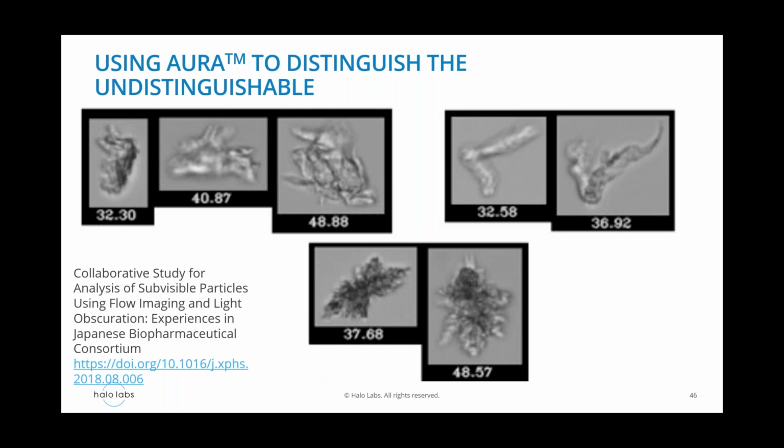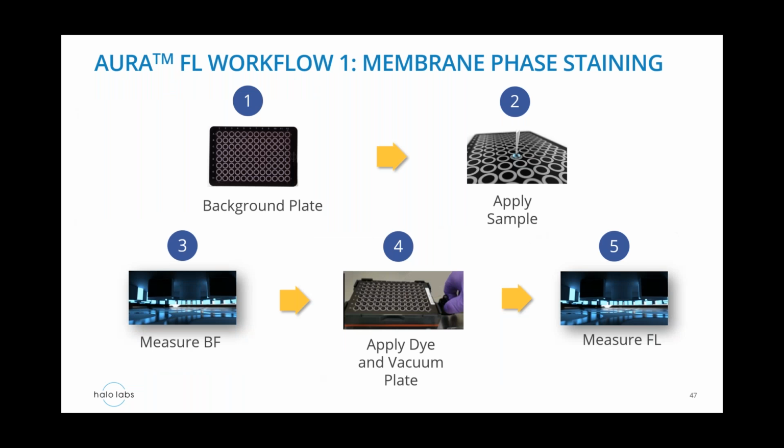We have a small case study where we want to distinguish, again, between proteinaceous and non-proteinaceous samples where morphological filters aren't enough. The workflow essentially just adds a fluorescent dye that is very specific to protein aggregates. It's called thioflavin T, and it's been validated for decades as the primary dye to characterize the binding of protein aggregates. Protein aggregates tend to form these microfibril structures due to misfolded beta sheets, and ThT is very specific to those and highly water soluble.